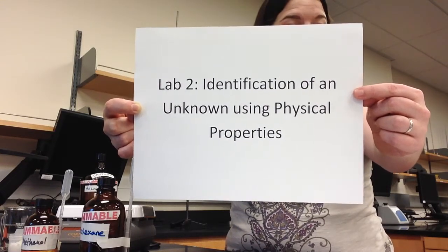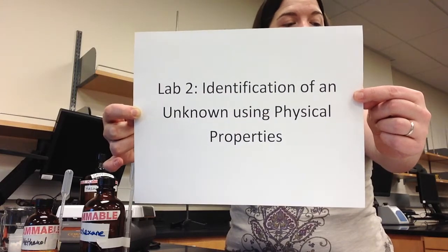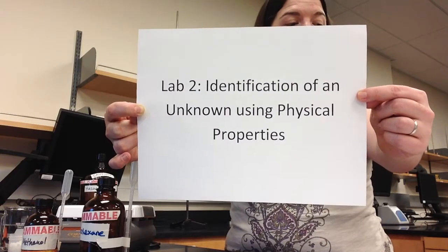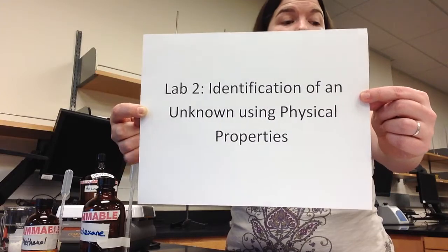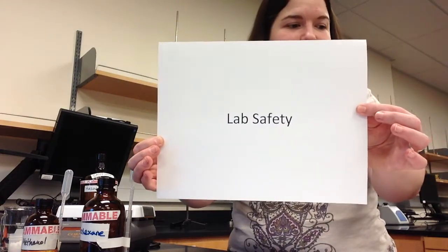You'll be working with a partner today to complete this lab. While you and your partner are sharing unknowns and supplies, each member of your group should record quantitative and qualitative data in their own lab notebooks and turn in individual lab reports. Next part of this video is all about lab safety.